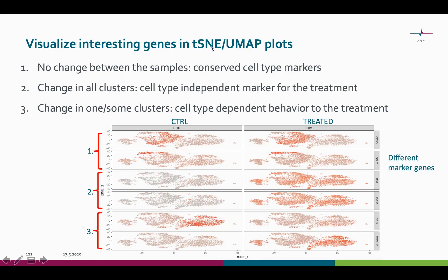We can also use the TSNE and UMAP plots to see the expression of selected genes in different scenarios. In scenario number 1, there is very little difference between the samples — these two genes are thus conserved cell type markers. In scenario number 2, there is very little expression in the control sample and lots of expression in the treated sample, so these two genes are cell type independent markers for the treatment.